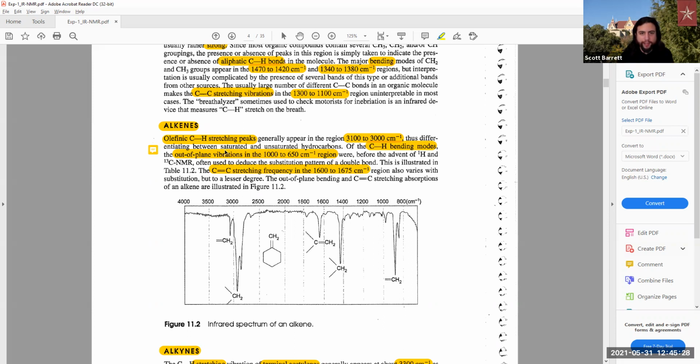And so finally, after this, in this fingerprint region, we will talk about this other part of the carbon-carbon double bond, the alkene stretching frequency, in the 1,600 to 1,675 region. And you can see that here with a tri-substituted carbon, where it's bound to two other groups, and then you have your alkene here, and that is indicative in this 1,600 to 1,675 region. Here is our alkane between 1,400 and 1,600. So that's much different than our alkene in this instance. It got shifted more, in this case, let's say upfield.